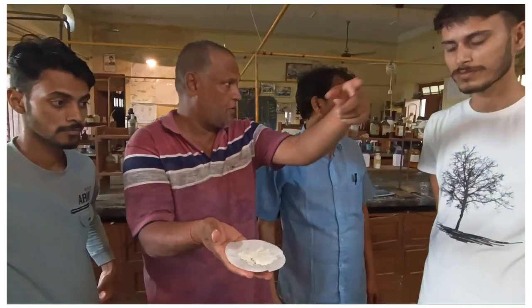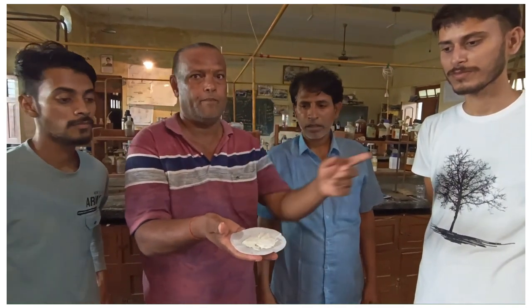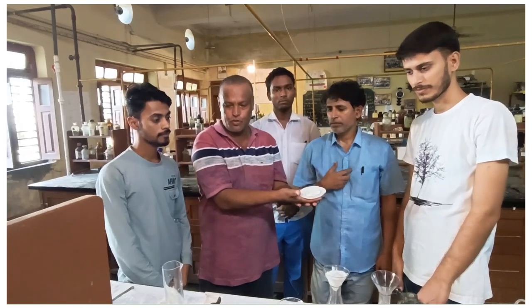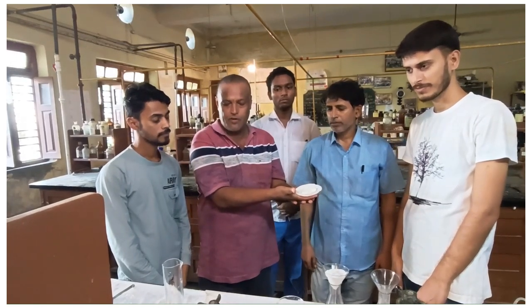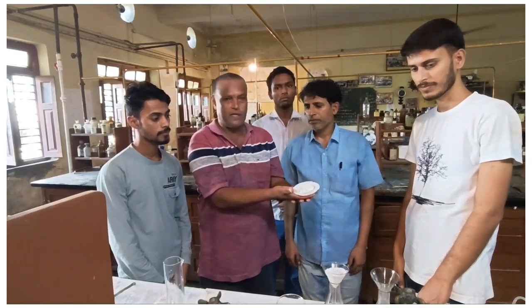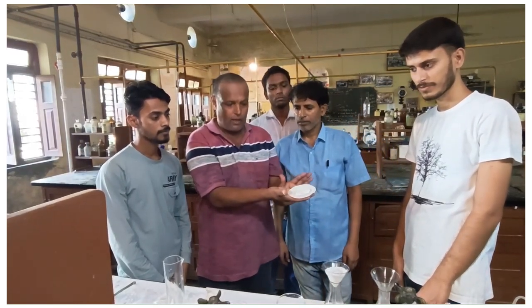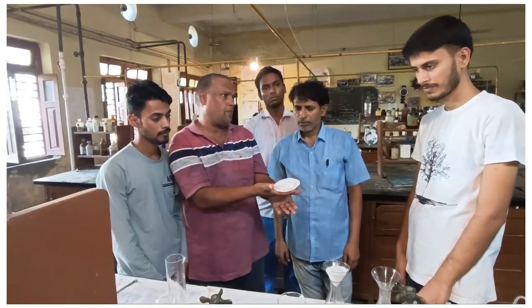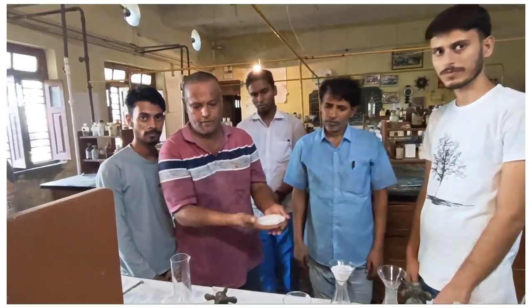You take the photo. Milk by following the different procedures as discussed in the chemistry practical book, or what we have gone through in the different manuals, we perform the experiment. After drying, we will wait, and this is the amount of casein what we collected from the 100 ml of milk. So thank you, best of luck.